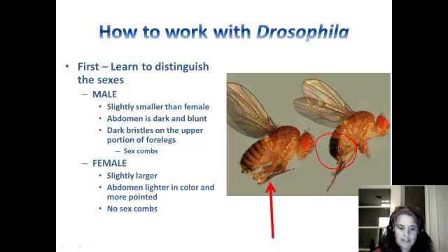And of course the female is just the opposite of all those things. And her abdomen sometimes can really deceptively look dark at the bottom. This is very clearly striped, but if you see a male and then look again, if you see any lightness at all in the end, you've got a female. That male is always very heavily dark on the back. So even if her stripes are kind of fusing together a little bit, usually you can still tell the difference.